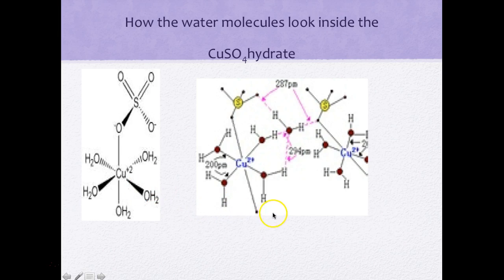All right. So again, there's a network of that everywhere, and that in a way holds up the crystal structure and gives the compound that nice crystalline shape.